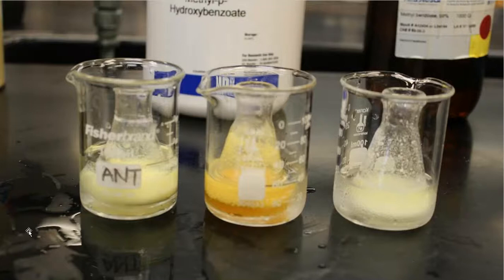All right, so here's a picture of all three of these now that I've added water. The very first one is the acetanilide. The middle one is the methyl p-hydroxybenzoate. And the third one is just the methyl benzoate. So those are the three labs that you'll be turning in, 1 and 2 and 3, and that's the order that you're seeing them. All right, so there's your observations of what happens after the water.